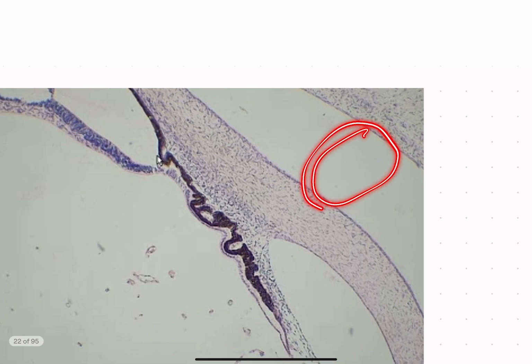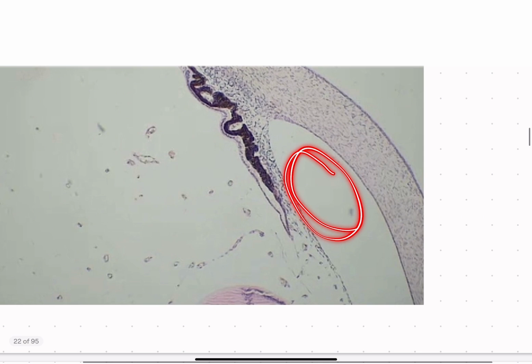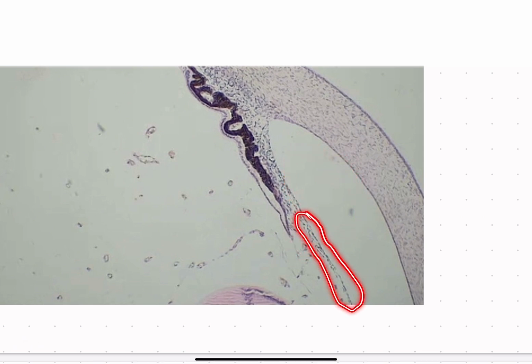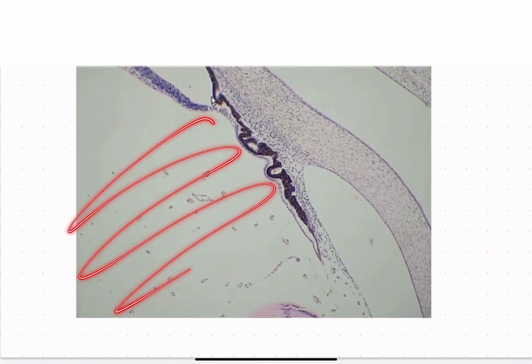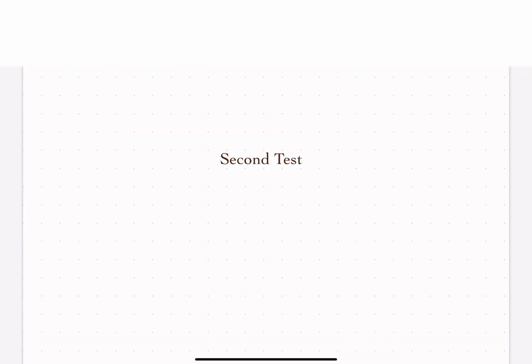We have the conjunctival sac / eyelid space. We have the anterior eye chamber, the posterior eye chamber. We even have the degenerative membrana pupillare here as well, a little bit of the lens, a little bit of the anterior cuboidal epithelium, and then here we have those arteria hyaloidea that Professor Vaivads mentioned as well. And all of this is the vitreous body.